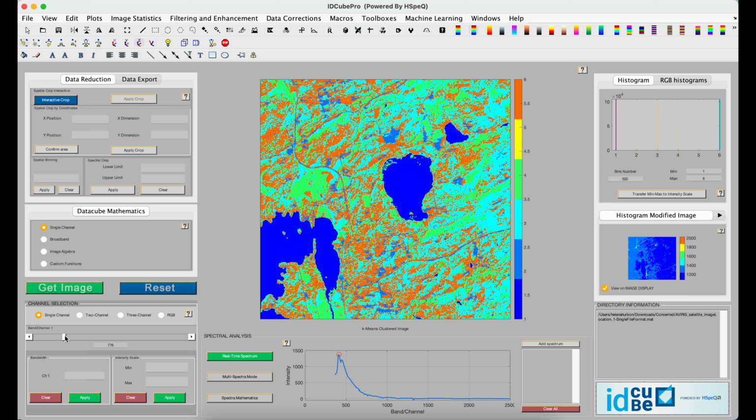K-means clustering is an unsupervised machine learning algorithm. It is the fastest and most efficient algorithm to categorize data points into groups, even when there's very little information available about the data. IDCube employs a K-means algorithm that chooses the initial values, or seeds, for the K-means clustering algorithm. The procedure initializes the cluster centers before proceeding with the standard K-means optimization iterations.